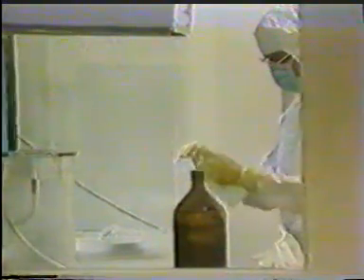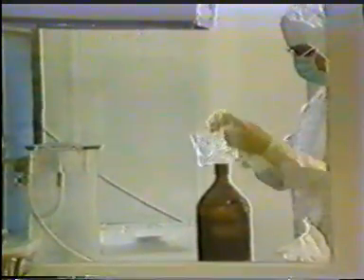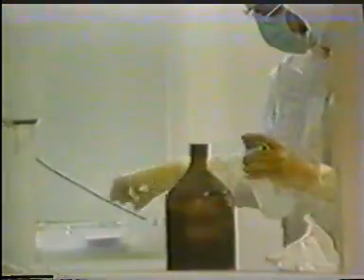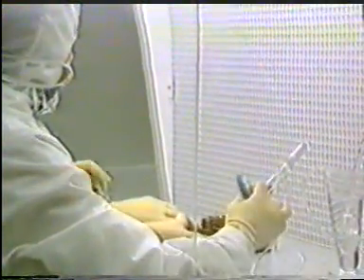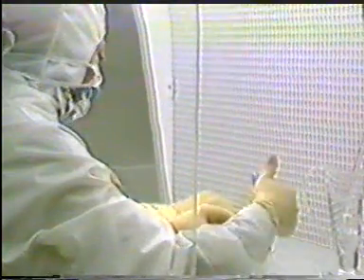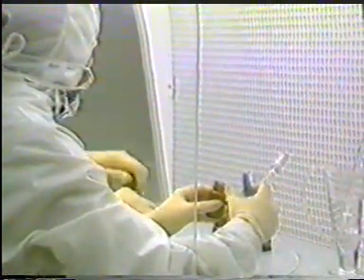The components should be sprayed with 70% industrial methylated spirit or other bactericidal solutions before being placed in the cabinet, and their outer wrappings removed only just before use. The operator should avoid touching those parts of the equipment that will come in contact with the sterile components, that is, the ends of needles, quills, injection ports, and other similar key areas. The container should be sealed as soon as possible after filling.